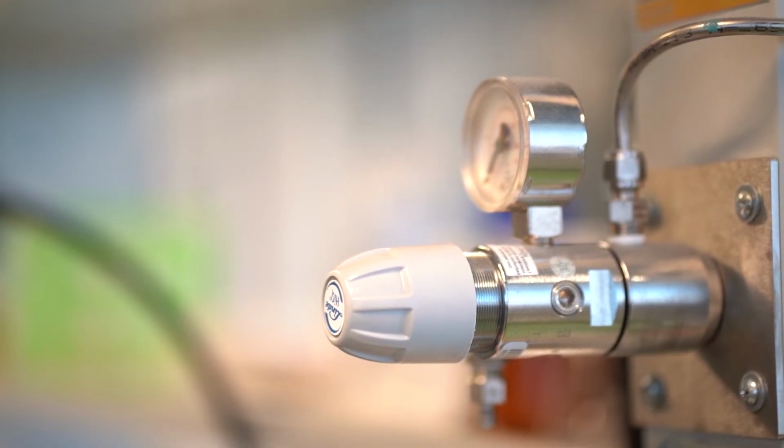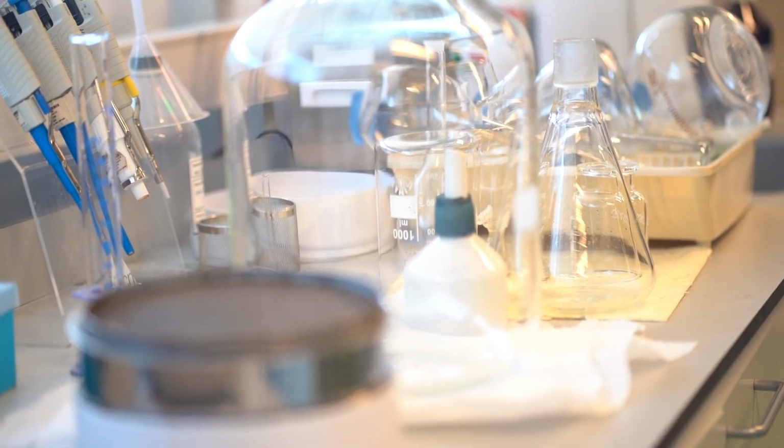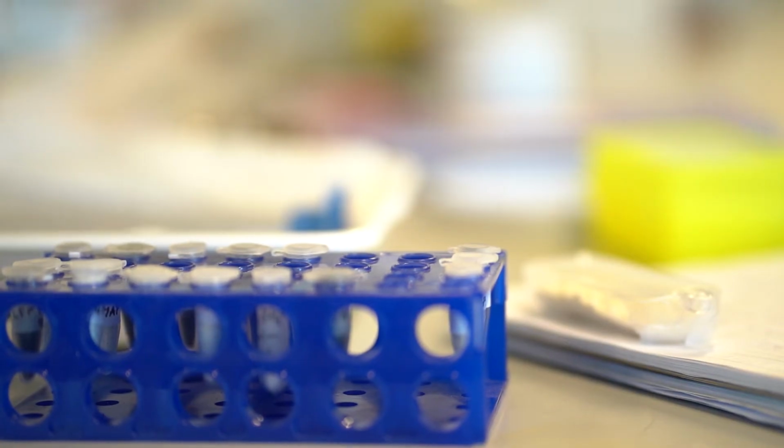Let's try to make an example with this small sample of a sandstone. So what you do is, once you bring it here to the lab, then you try to catalog it. So as everything in a museum, also in a lab, we need to have a catalog where we can associate this particular sample that is archived in our lab to a particular formation for perpetuity if we are lucky. Once it's cataloged, you want to do some experimentation, some tests on it.